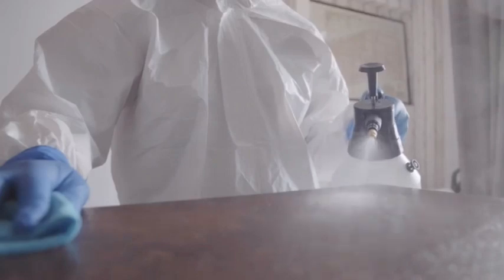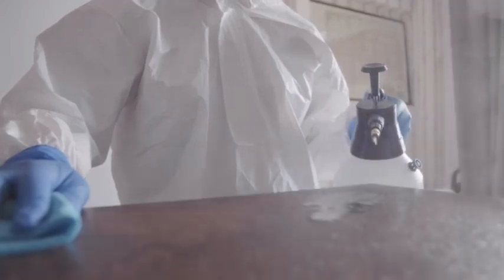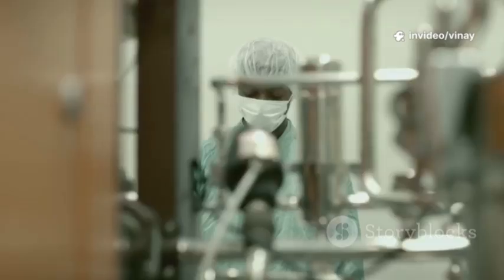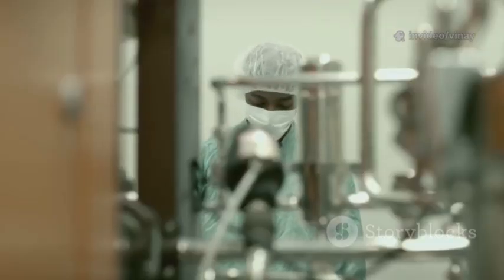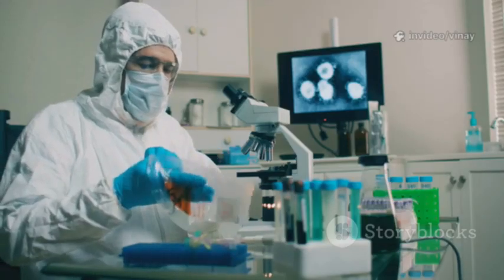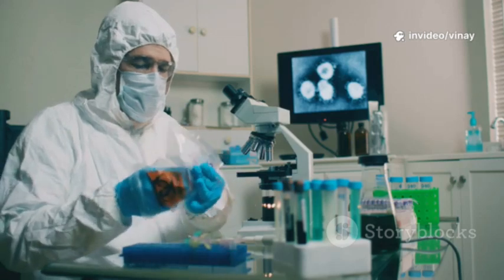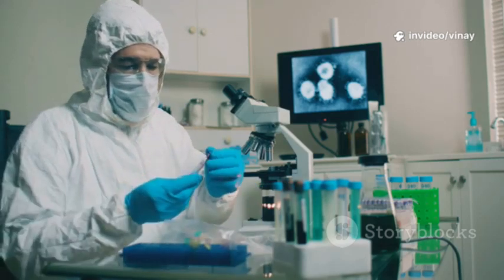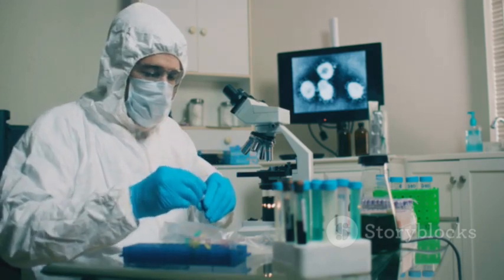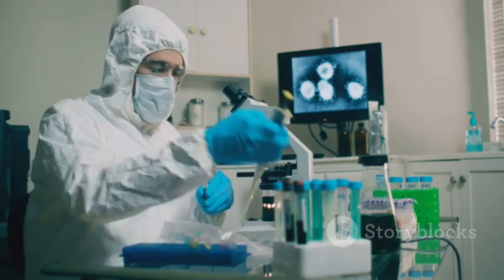Surfaces that are not properly cleaned and disinfected can harbor and grow microorganisms, which can then be transferred to sterile components. To mitigate this, manufacturers must implement a comprehensive and scientifically sound environmental monitoring, or EM, program. This program involves routinely sampling the air and surfaces throughout the cleanroom suite to detect the presence of microorganisms, providing an ongoing measure of the state of control of the facility.